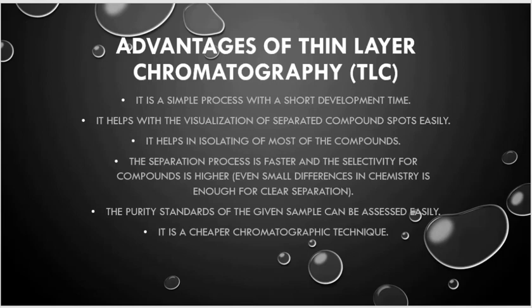The separation process is faster and the selectivity of the compound is higher, even for small differences, giving a clear separation, a very uniform separation. The purity standard of a given sample can be assessed easily. It is a cheaper chromatography technique. That is why we use TLC widely.